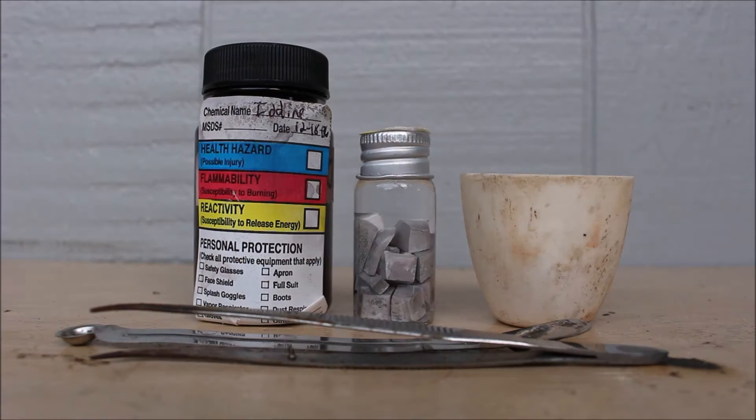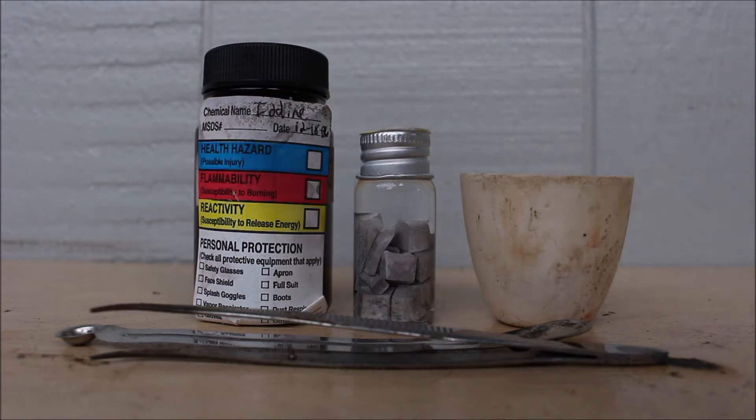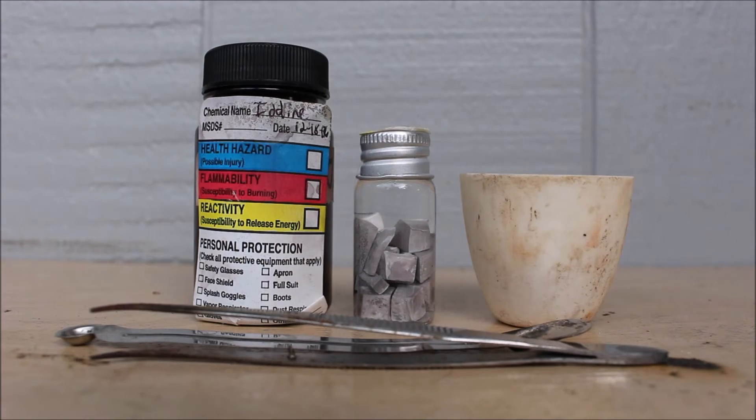The reaction we're going to do today is to observe a reaction between sodium metal and iodine. Sodium metal is a soft, silvery, alkali metal that's very reactive, and iodine is a halogen that's black or purple and sublimates at room temperature. They're both very reactive.